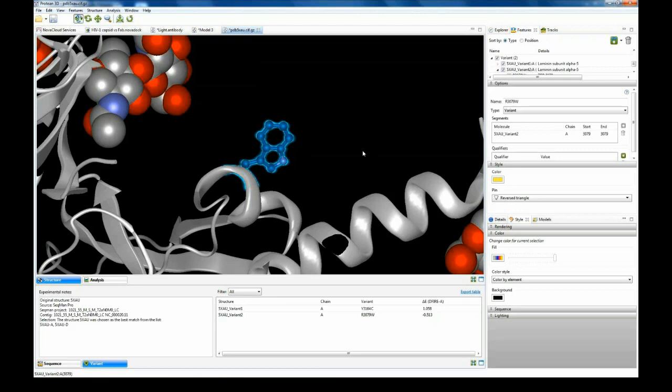An additional nice feature that will be coming out in 15.2 is that the table that shows these mutations will actually have labels to help people know if it's stabilizing or destabilizing as well. Perfect. Thank you.